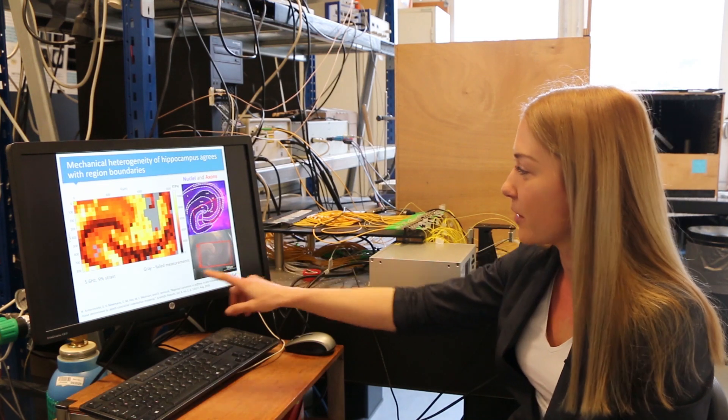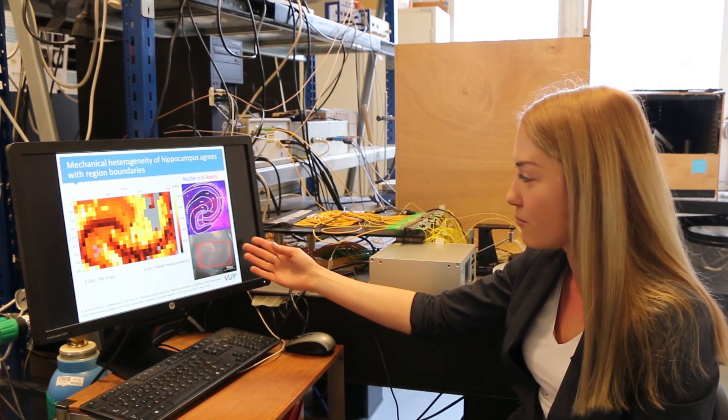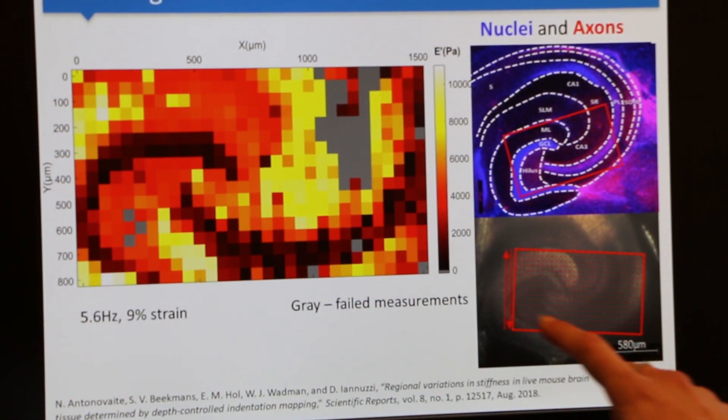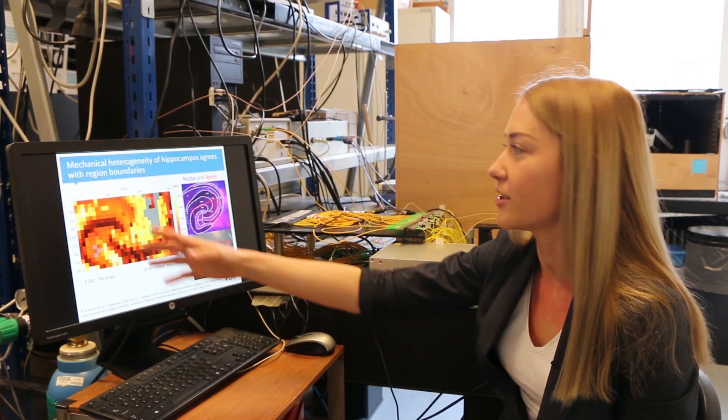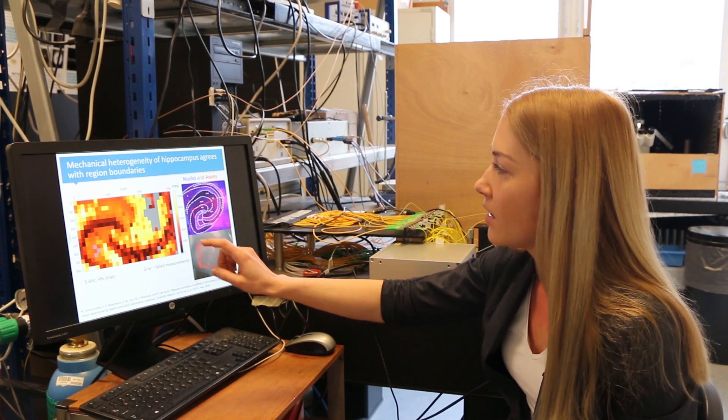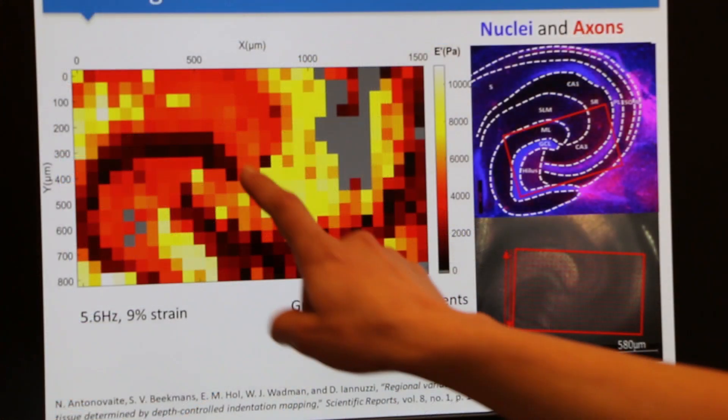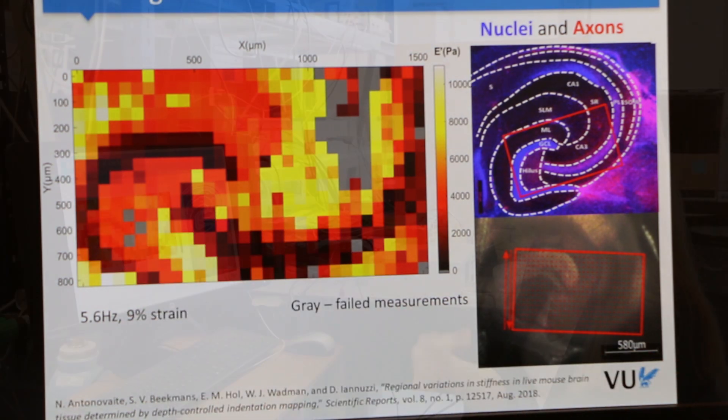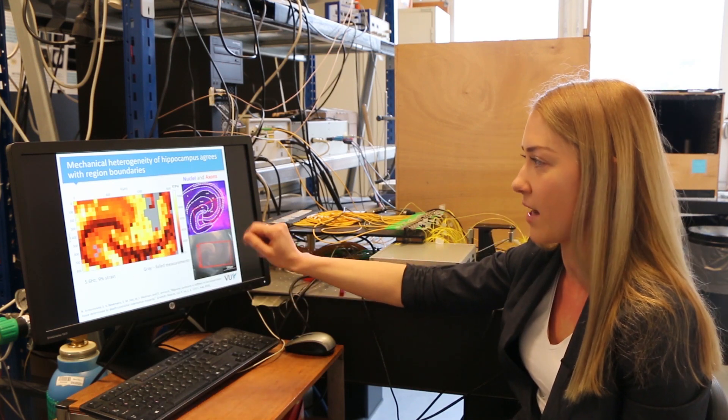In this picture you see the inverted microscope image of hippocampus. The red dots indicating different indentation locations that we do by scanning. And here is the storage modulus map. So you see that the regions with dark color are really soft and the regions with bright yellow color, they are much stiffer. And that correlates to the actual structure of the brain.